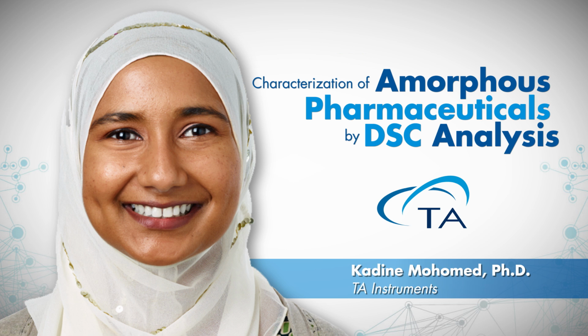Okay. We have time for one more question, and that is, thank you for the information presented today. However, I'd like to know if DSC can be used to perform purity analysis through the melting peak of a crystalline sample. Yes, so I know this presentation focused mainly on the glass transition and amorphous content, and hopefully we'll be able to do another presentation where we cover polymorphism, crystalline melts, and purity. The answer to that question is yes.